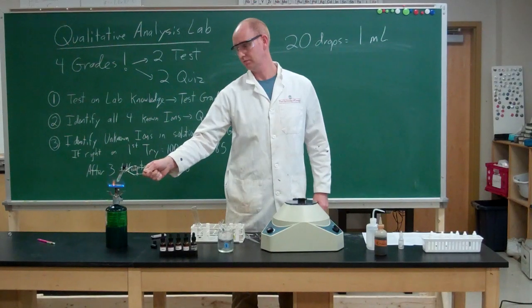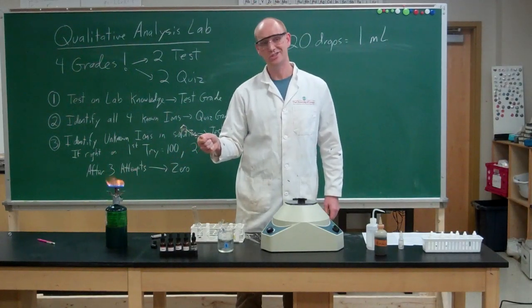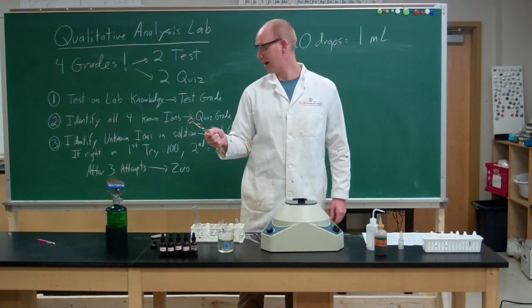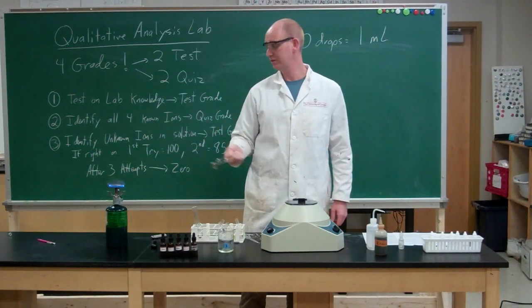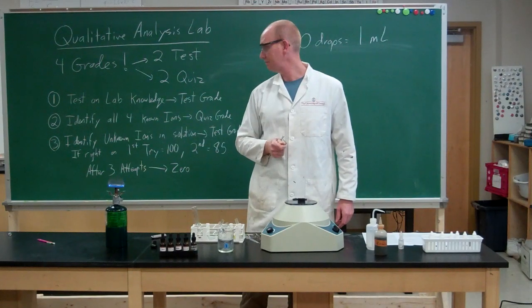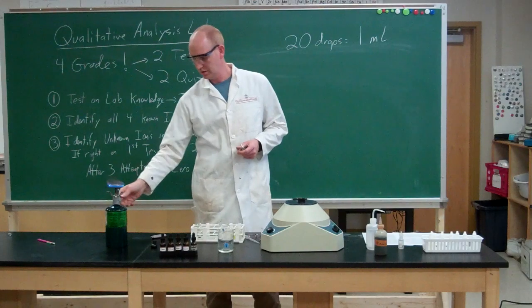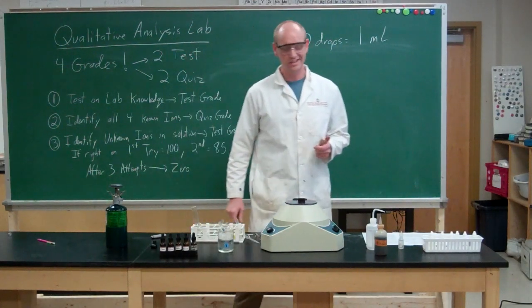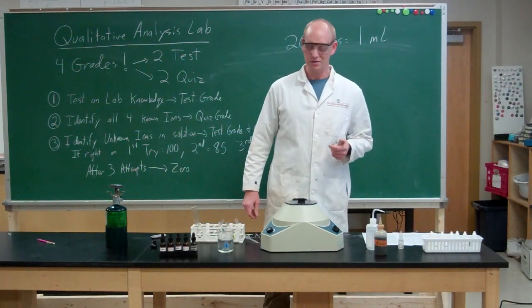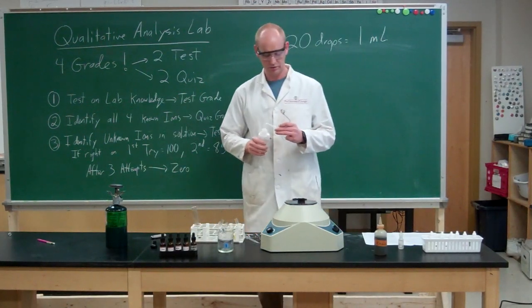Now, best case scenario, when this occurs, is that it just blows the stopper off. Worst case scenario is you end up with a bomb on the end of your hands and it goes everywhere. So, we don't heat a closed system. If we catch you heating a test tube with a stopper on it, we'll probably just kick you out of the lab. So, how are we going to heat on a hot water bath?